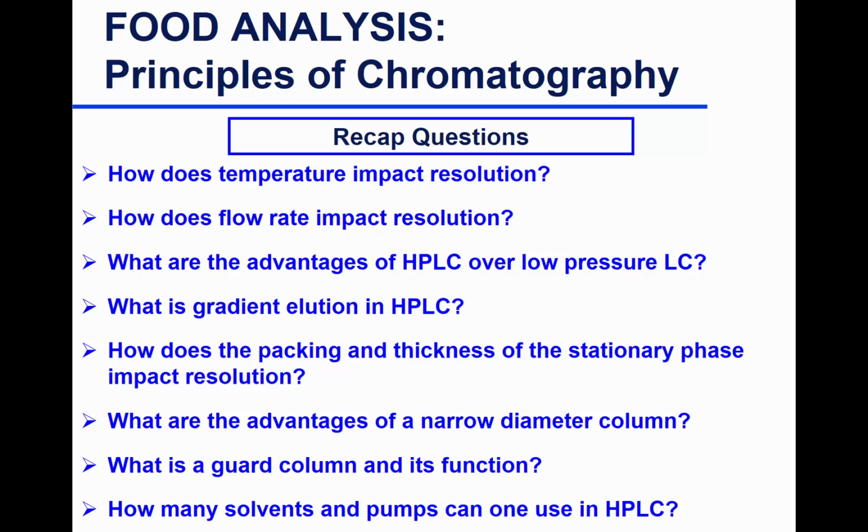What are the advantages of HPLC over low pressure liquid chromatography? Okay, Joe? It's faster. One is faster. What else? Josie? Reusable column without having to pack yourself. Yeah? Better resolution. Better resolution, better efficiency.